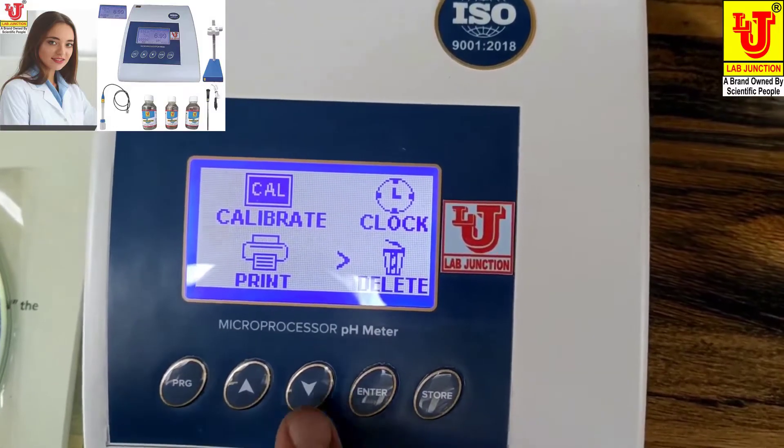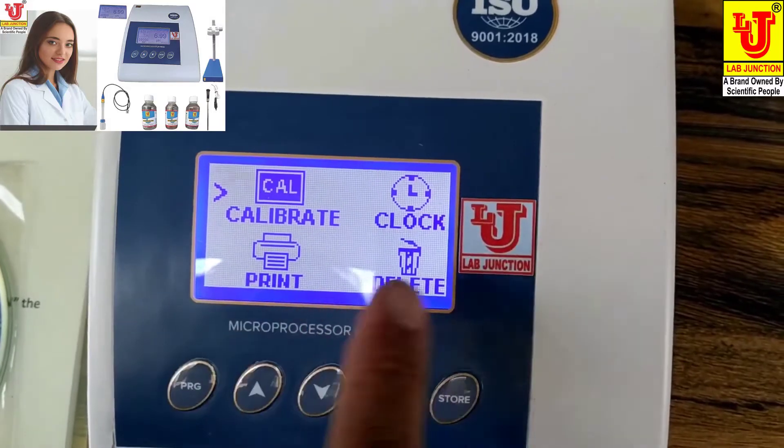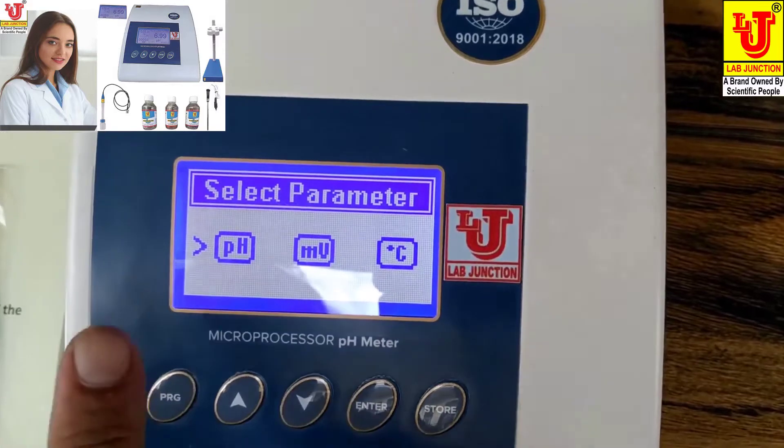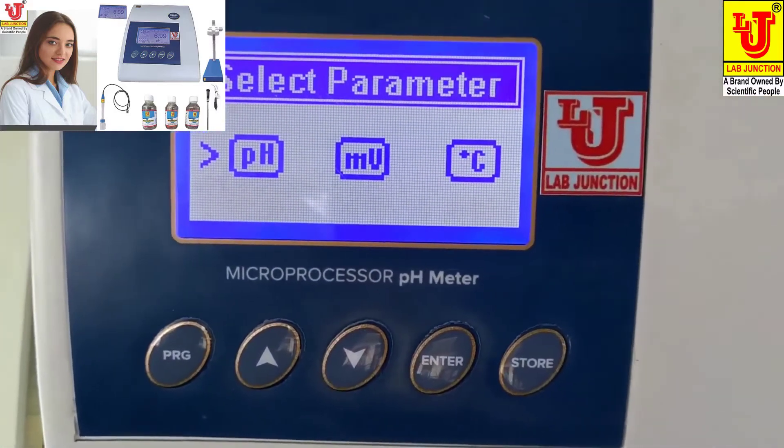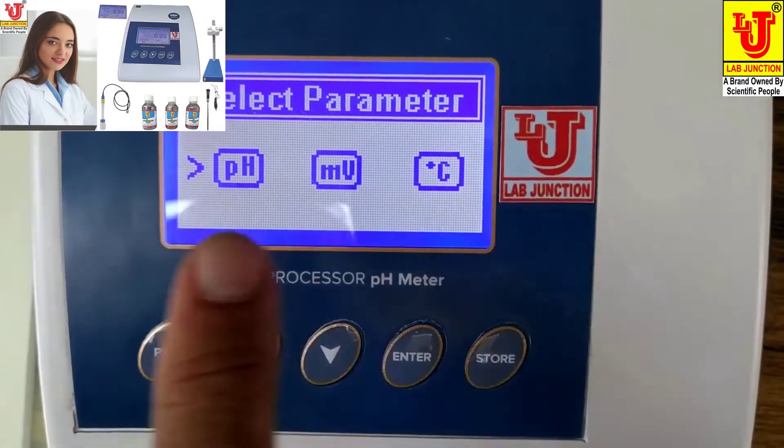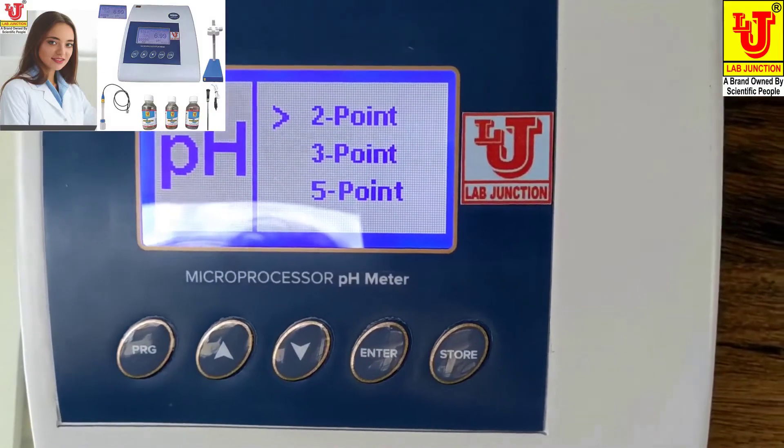Main is how to calibrate the pH meter. You go to calibrate and press enter. Three parameters: pH, millivolt, temperature, which you have to calibrate. Main is the pH. You can press enter.